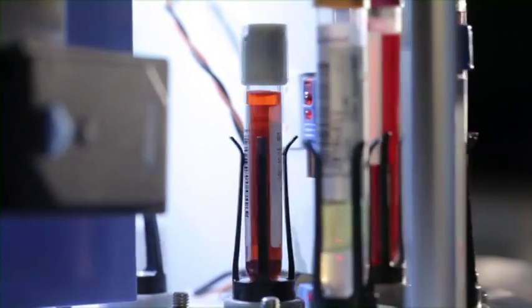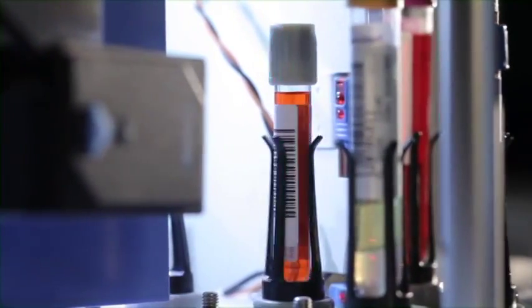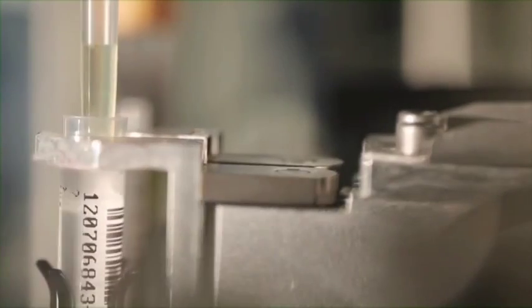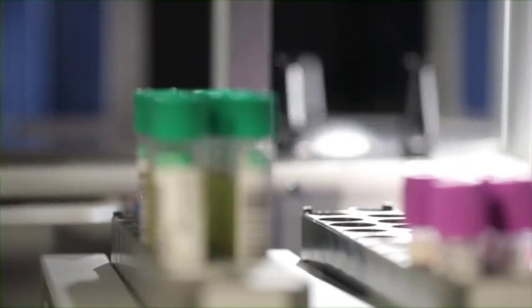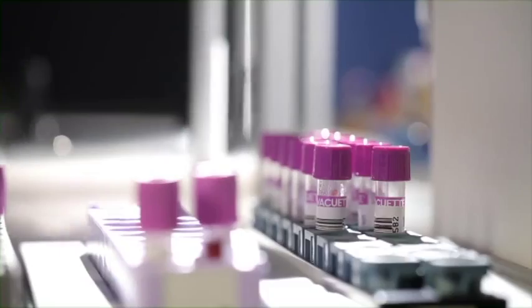These functions include tube identification, decapping, aliquoting into secondary tubes, capping, and sorting of tubes into different destination positions.